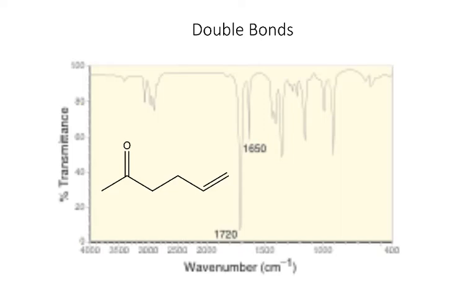All right, and finally, when we look at double bonds, when I see really high intensity peaks in the double bond region, in this case about 1,700 wave numbers, that's a dead giveaway that this is a carbon double bonded to an oxygen, right? And then this lower intensity peak at slightly lower frequencies, this is probably a carbon-carbon double bond.